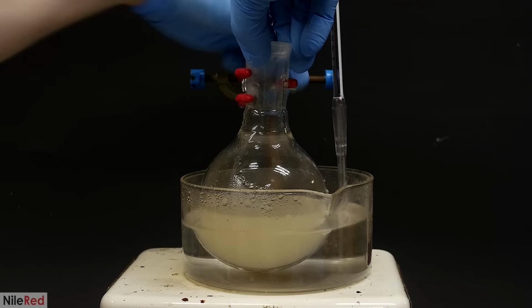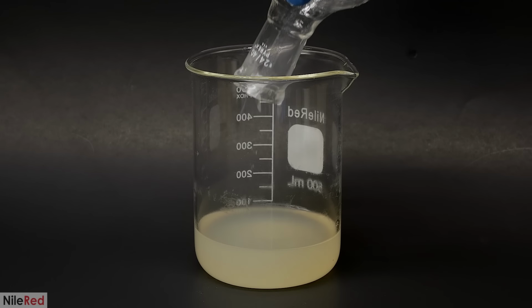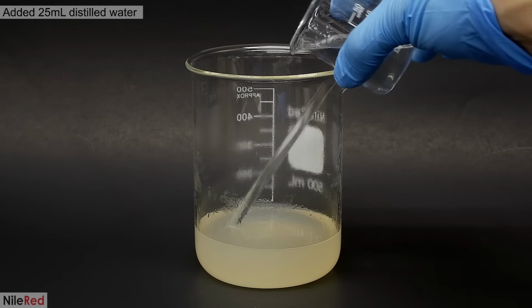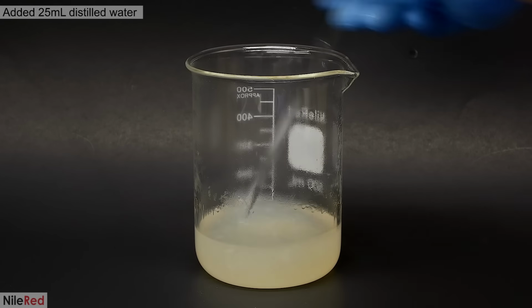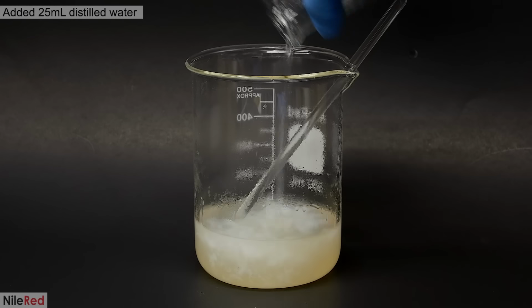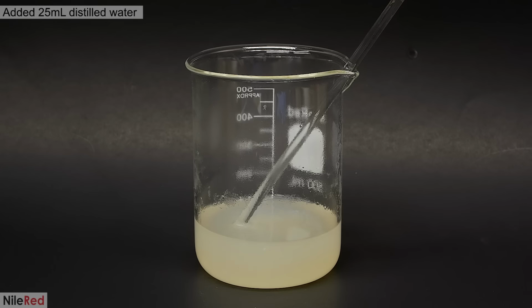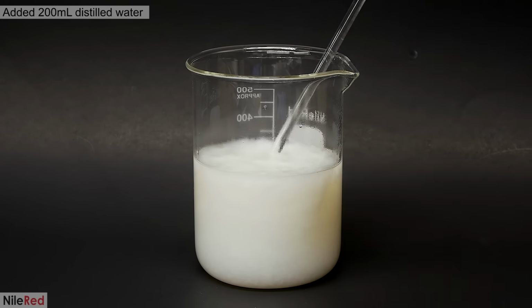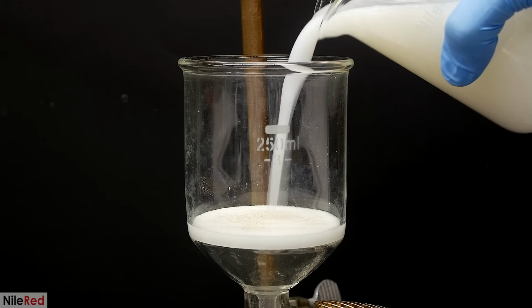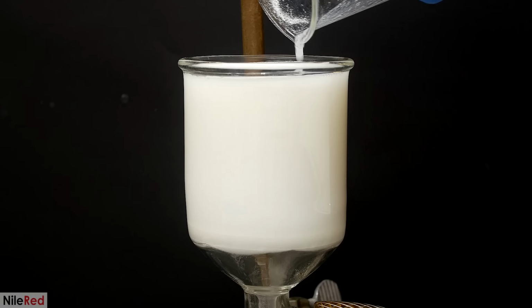When it's done, I transfer everything to a beaker, and from this point on, the workup is exactly the same as the last run. I slowly add 25 ml of distilled water, with stirring in between. In the previous run, it seemed like once the precipitate appeared, it was there to stay, but this time, it all redissolves back into solution. To really knock it out, I have to add a bunch more water, so I pour in 200 ml. I mix it thoroughly, let it sit for a couple minutes, and then transfer it to my vacuum filter.